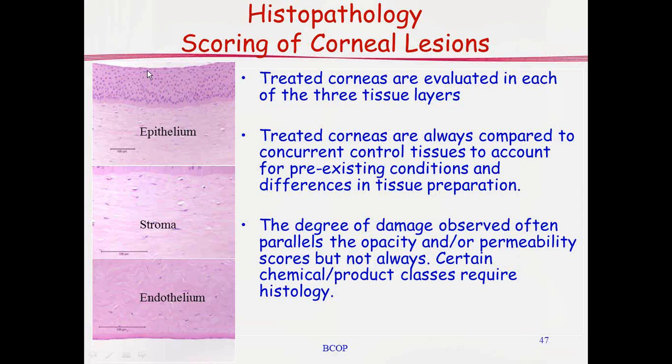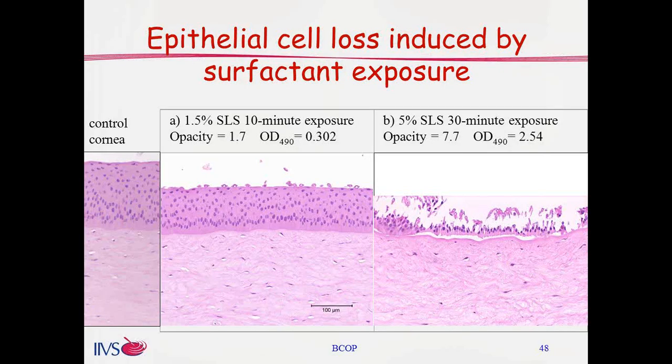and we evaluate for damage that may occur upon the application site and any damage that may be indicative of penetration of the cornea. So we look for both cellular and architectural changes in each of these cell layers, and also look for the degree of these changes to help us understand the nature of the injury and whether there may be a notable event here for irritation.